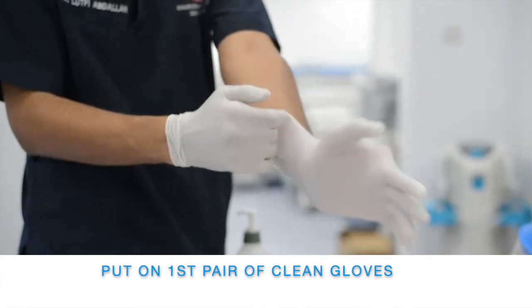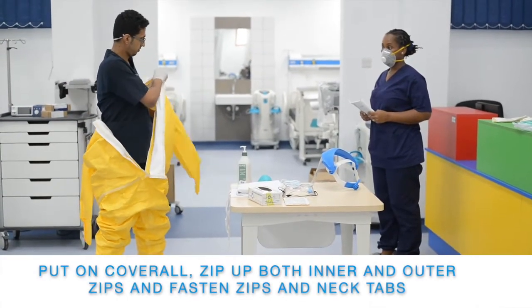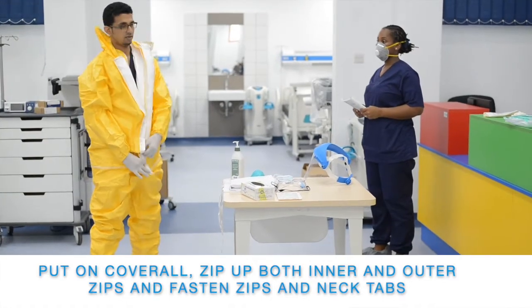Put on the first pair of clean gloves. Put on the coverall, zip up both inner and outer zips, and fasten zips and neck tabs.